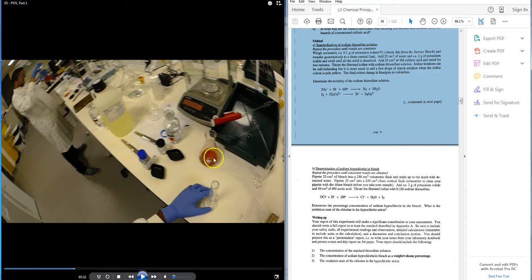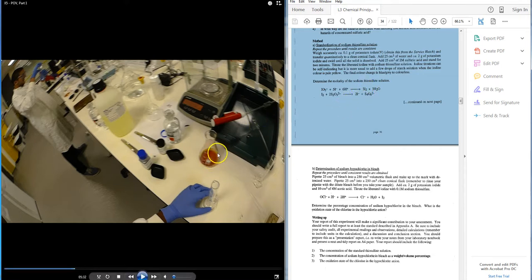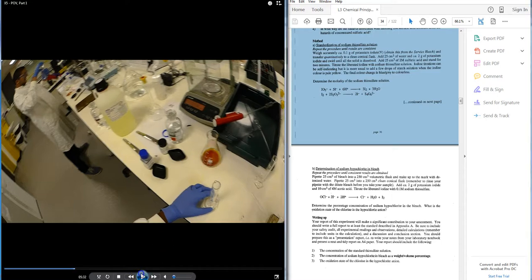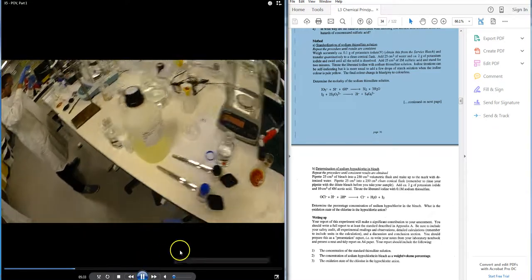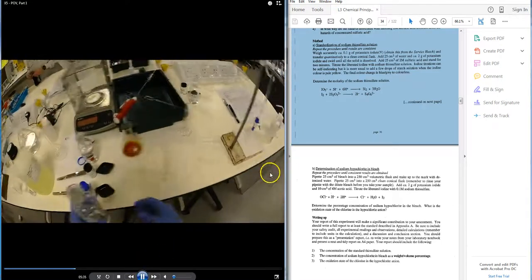And you should have at this point this liberated iodine in solution, which is a murky brown. And then I'm going to start to see this murky brown solution here.